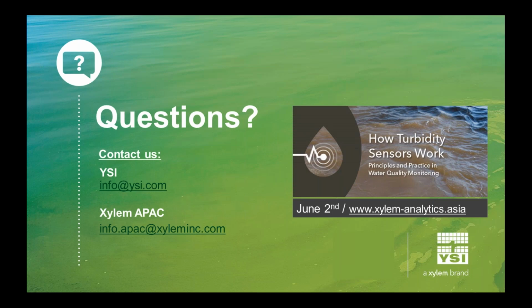Is there a sensor that differentiates toxigenic from non-toxigenic cyanobacteria? Oh, thank you, whoever asked that question, because that is a very common misperception. We always talk about these sensors in the context of harmful algal bloom monitoring, and harmful algal bloom typically means toxic algal blooms. The sensor does not tell you anything about toxicity. The sensor tells you that there is the potential for toxicity.